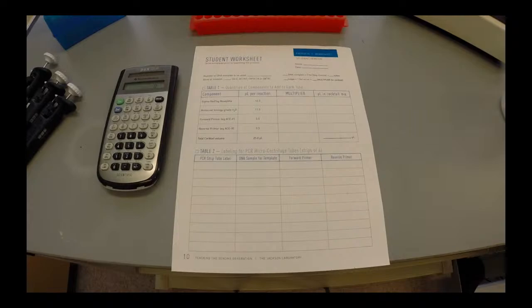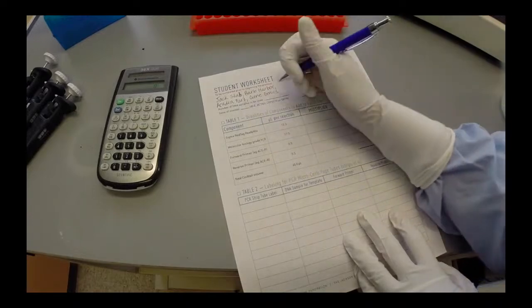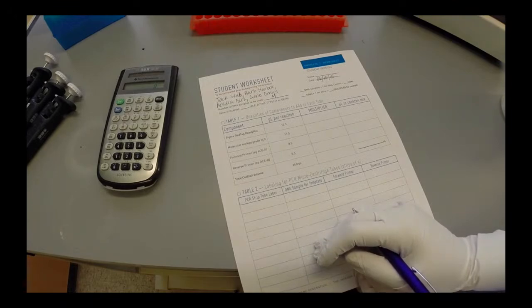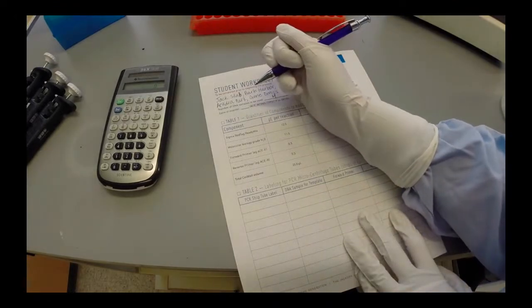In this example of Protocol 2A, 4 students are amplifying the actinin 3 gene from all 4 of their DNA samples. This information is filled out on the left-hand side of the worksheet.